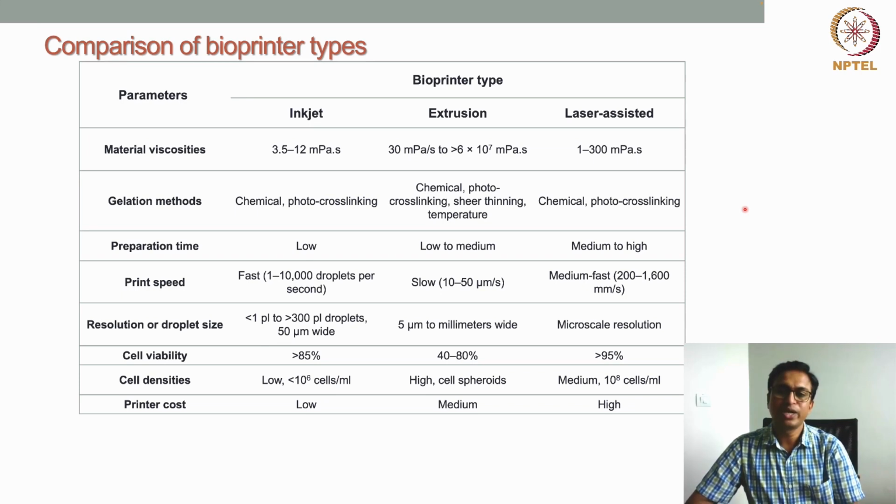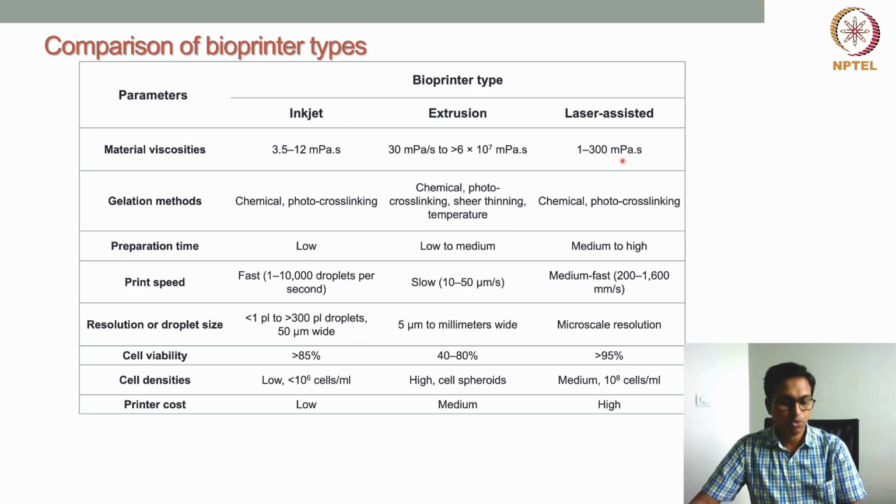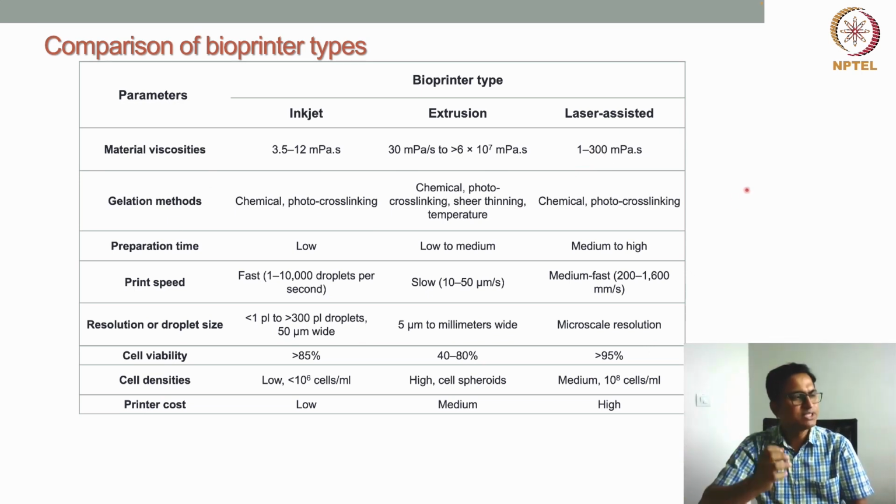So that's why if you use very high viscous material, there will be a problem of dislodging the material, a huge problem in the droplet generation. So in case of laser assisted bioprinting, mostly we use low to moderate viscous material. Now we have also discussed the gelation methods.